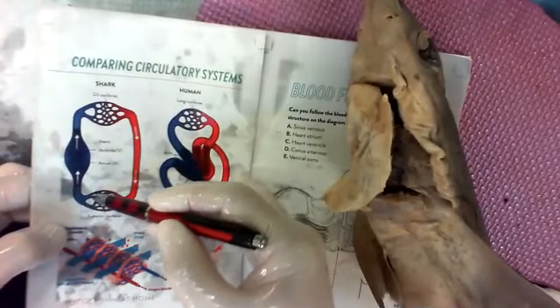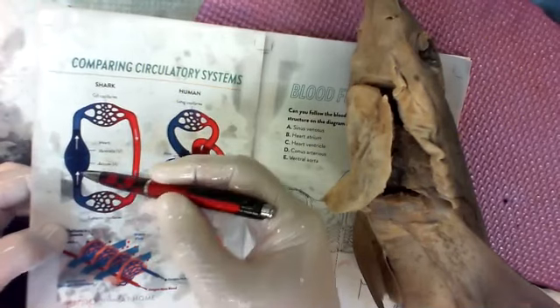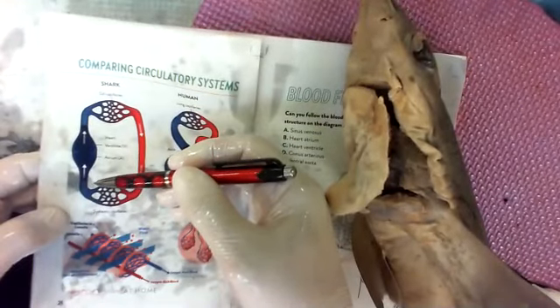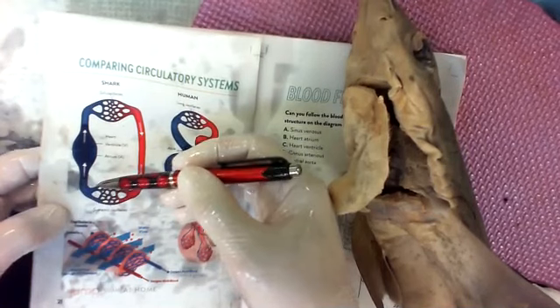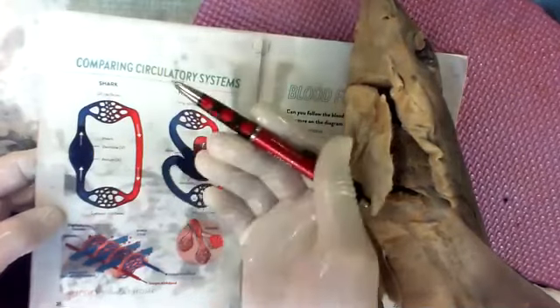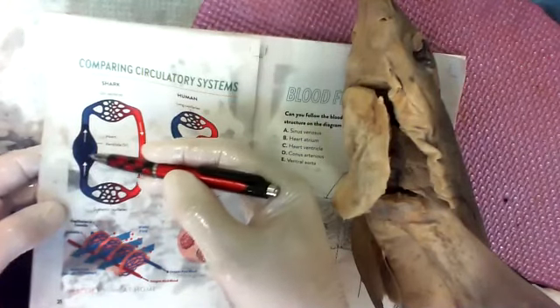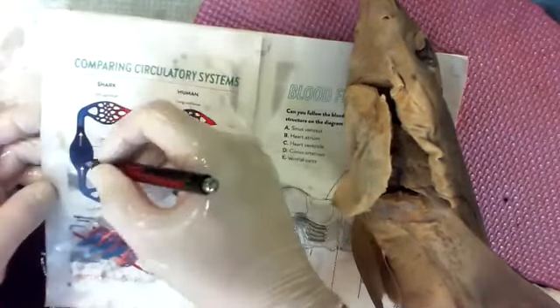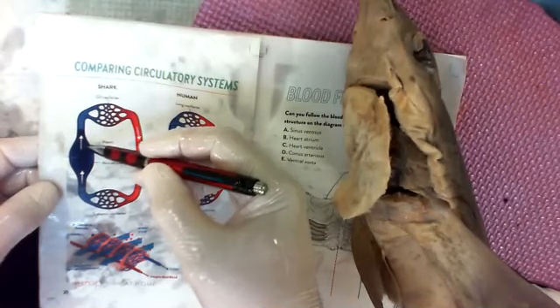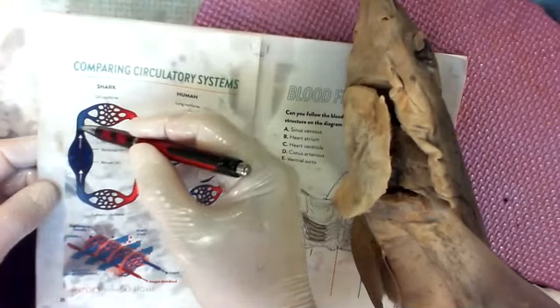Here's a shark. Blood comes from the body, all used up, goes into a sinus that actually has a big cone area called the sinus venosus, which, when you learn other languages, a lot of languages flip the words. So instead of saying a venous sinus, a sinus from the veins, they would say sinus venosus. They just flip the words. Right? So here it collects the blood from a bunch of blood vessels, dumps it into the atria. The shark's heart is actually kind of S-shaped. We'll see that when we take the heart out. Goes from the atria to the ventricle. The ventricle squeezes into a cone that's just the opposite of a sinus, called the conus arteriosus.